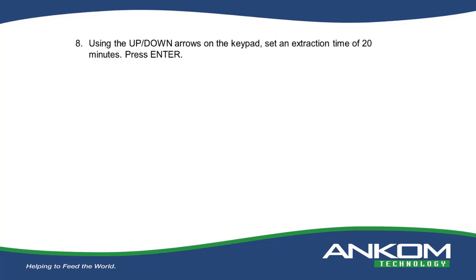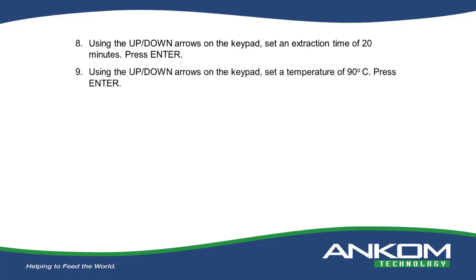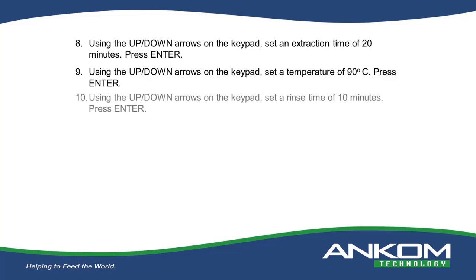Using the up and down arrows on the keypad, set an extraction time of 20 minutes. And when you have that on the setting, press Enter on the keypad. Next, again using the arrows, set the temperature of 90 degrees C and press Enter. And again, next on the keypad, set a rinse time of 10 minutes and press Enter.